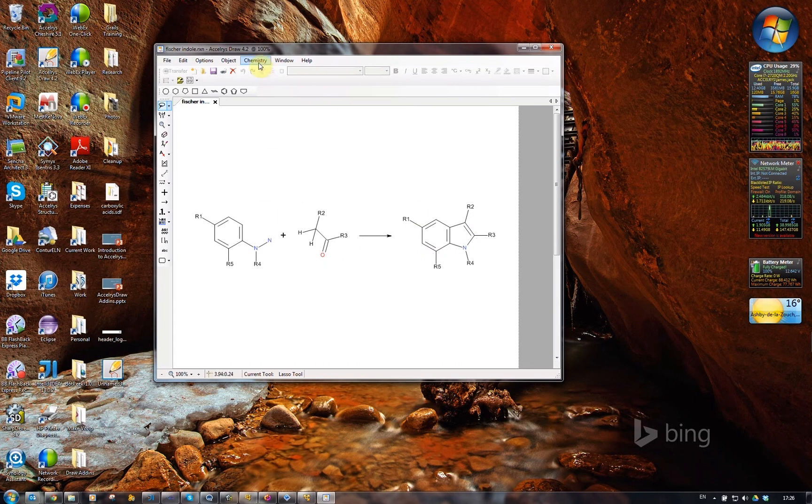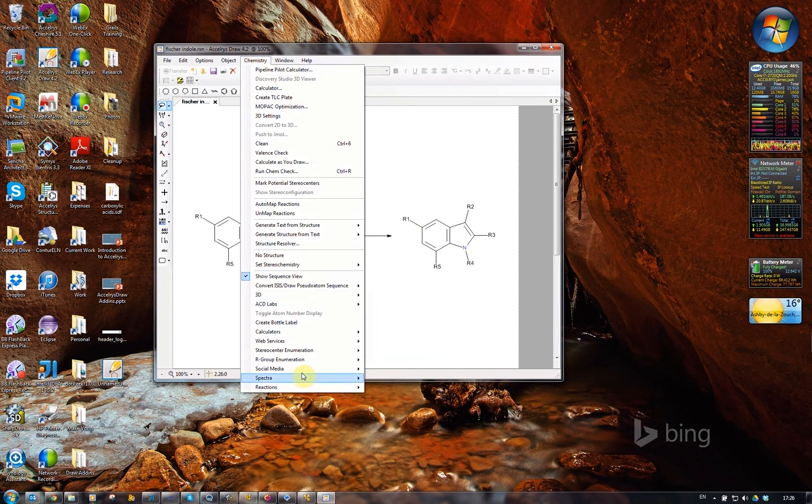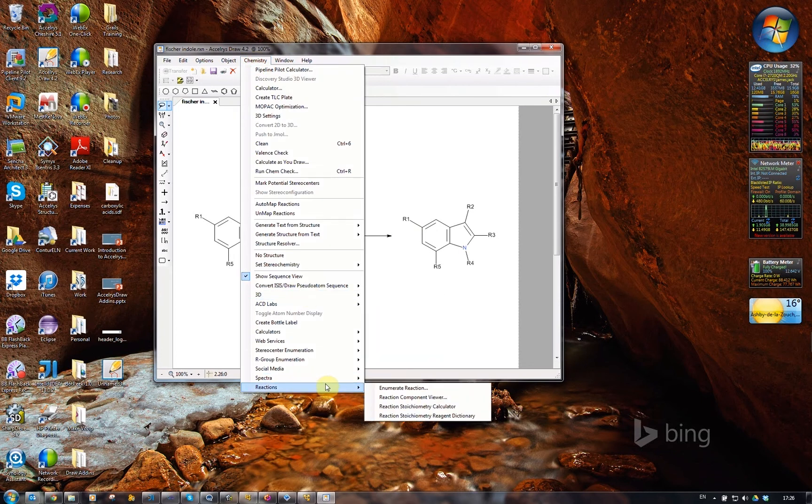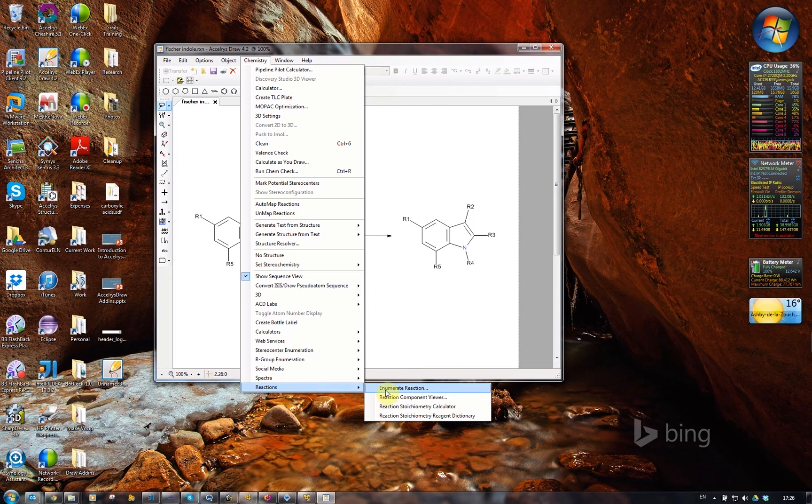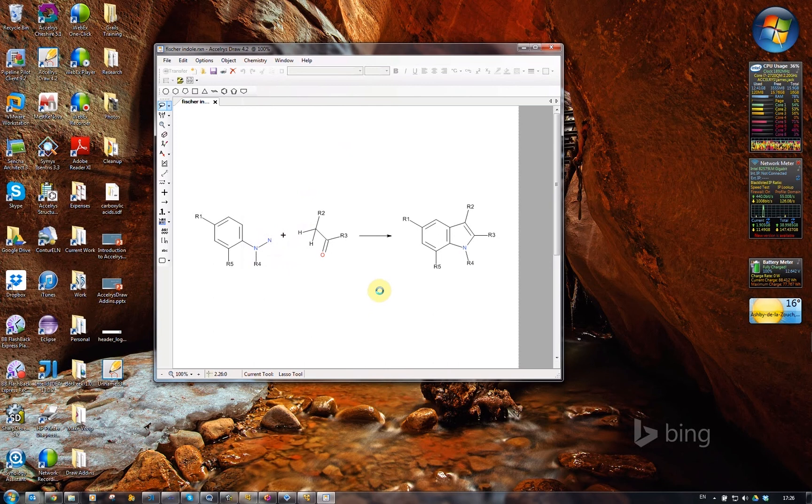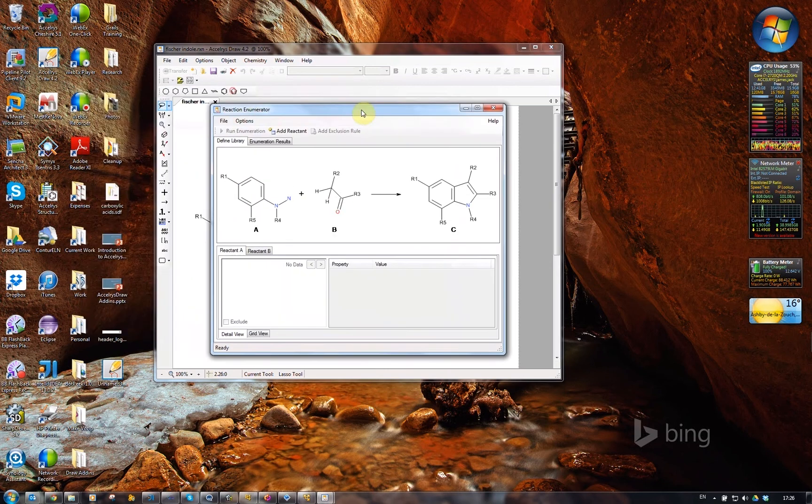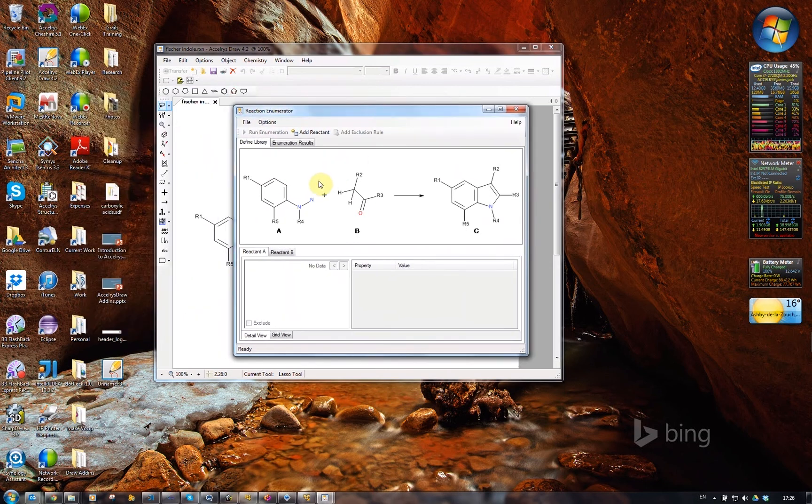I've loaded the reaction, and if you were observing before, you would have noticed that the enumeration menu was disabled because there was nothing on the canvas that it could enumerate. Now it's detected a reaction that it can enumerate, and now I've got this nice reaction enumerator dialog.